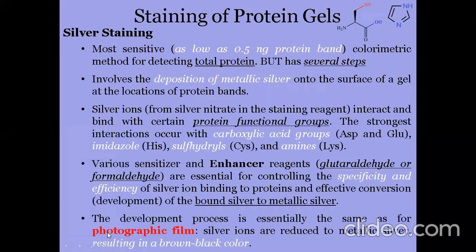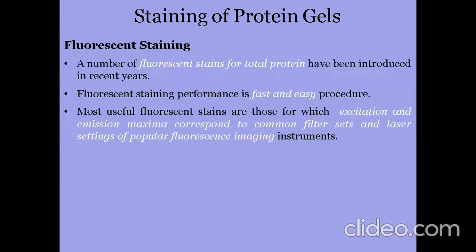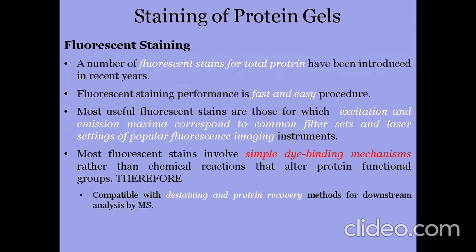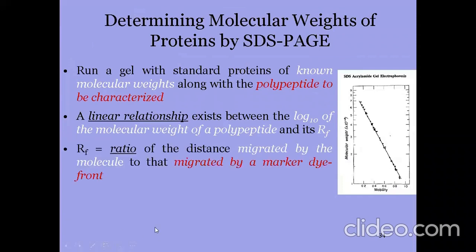After that, a linear relationship exists between log 10 of the molecular weight of the polypeptide and its RF value.